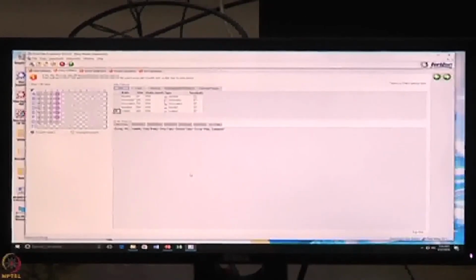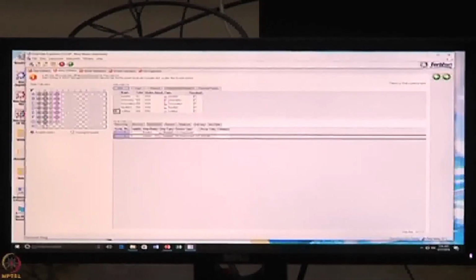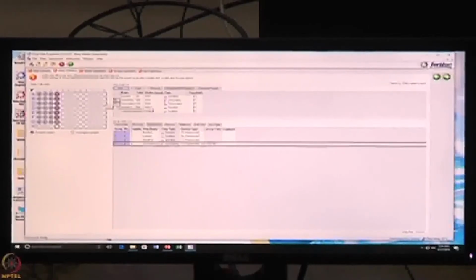So these are the steps. We have to assign the order for the instrument, the robotic arm, to follow in the backend flow. What is the first step here? I will take this arrow mark and double click on this. It is just a cross mark. So the first step is your baseline. The next step is the loading, so I take this arrow mark and double click again. Then the third, I have one more baseline, baseline 2, so I double click on this. The fourth is your association. Double click on this.